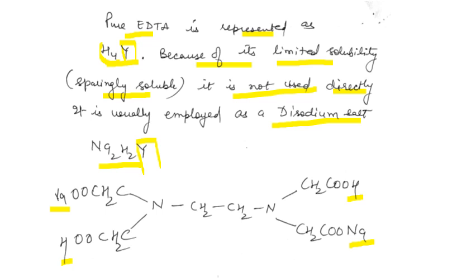This is the disodium salt of EDTA. It is used because it is highly soluble in water and it forms a complex with the hardness causing ion.